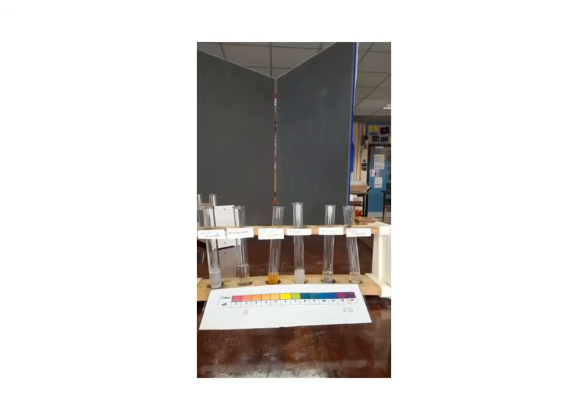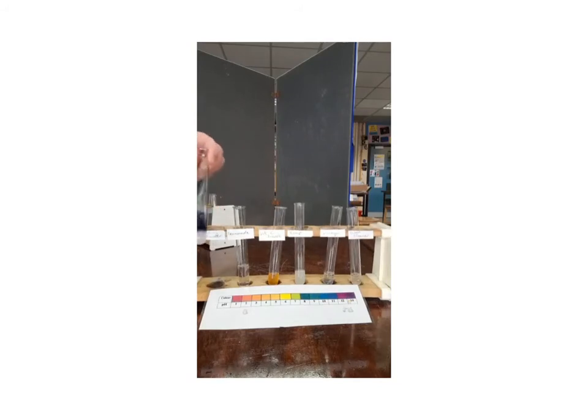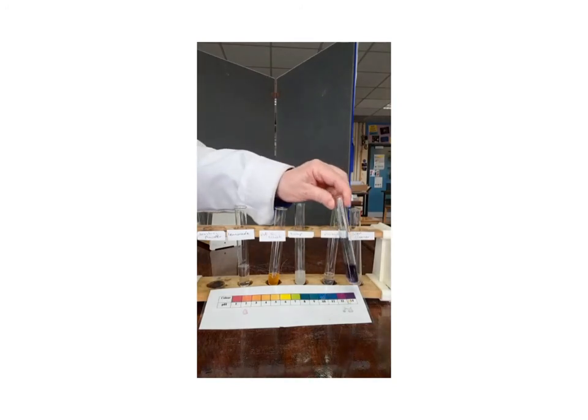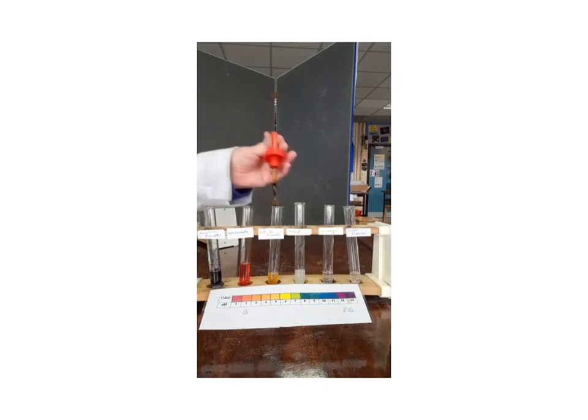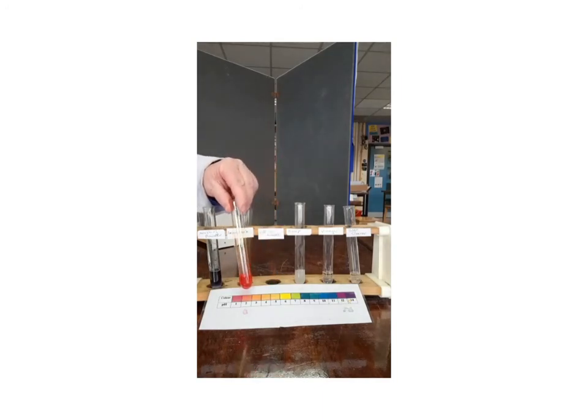Testing the pH of different solutions using universal indicator. Our first one is washing powder. We have a deep purple colour. Lemonade is our next one. We have an orangey red. Vitamin C is an orangey red.